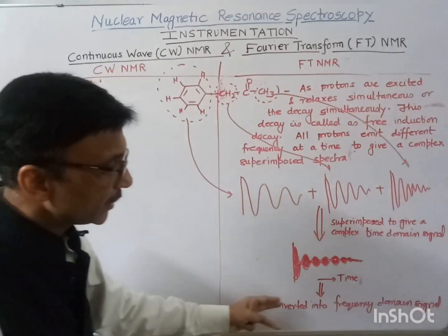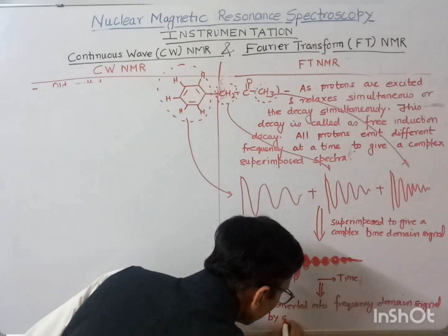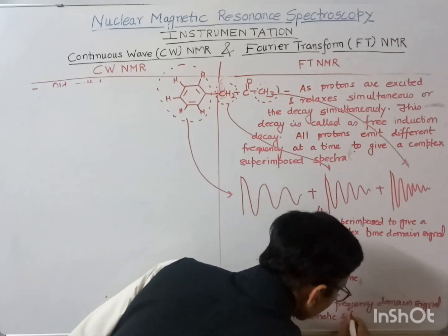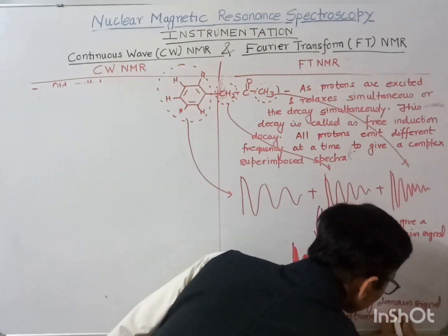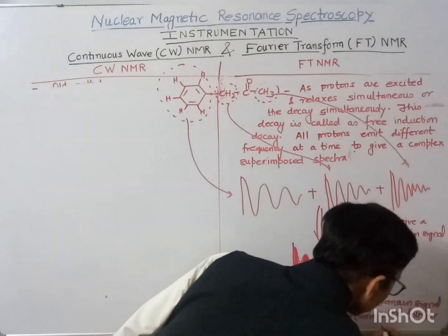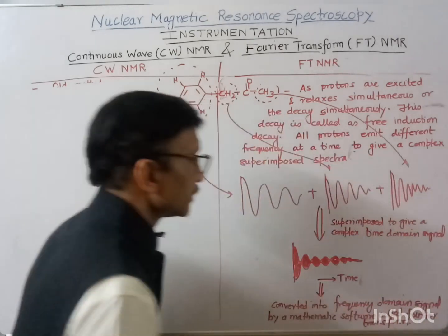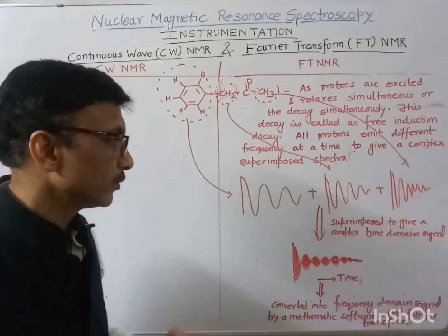The Fourier transform will transform the time domain signal into the frequency domain signal.